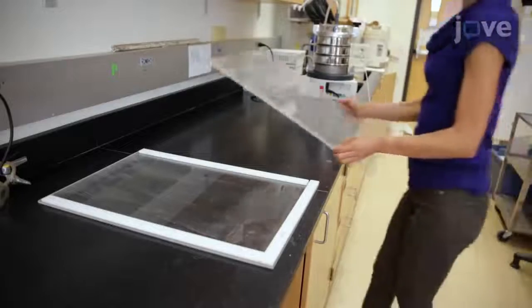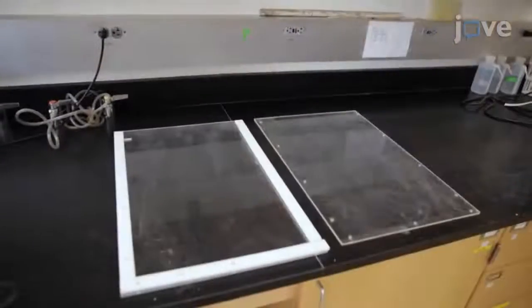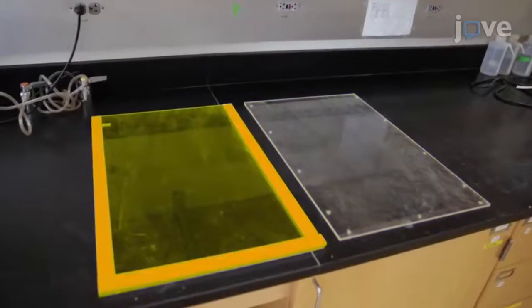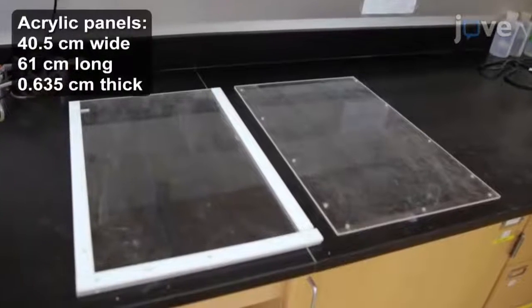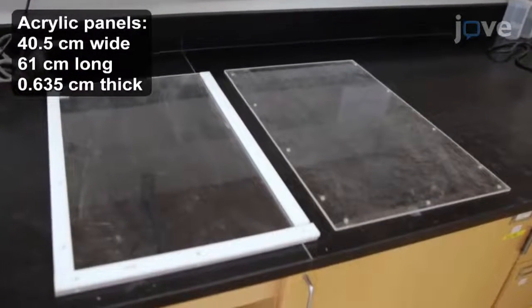Gather the parts for the rhizobox for assembly. These include front and back panels made of clear acrylic about 40 cm by 61 cm.